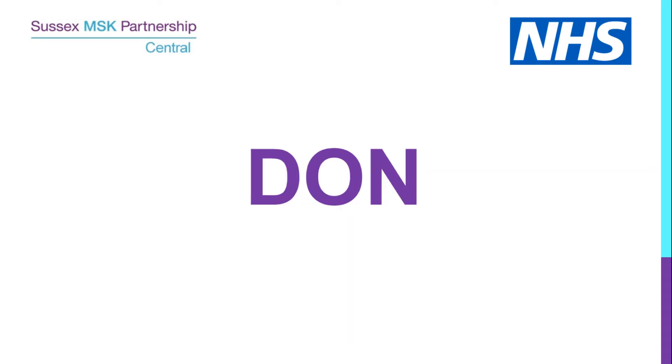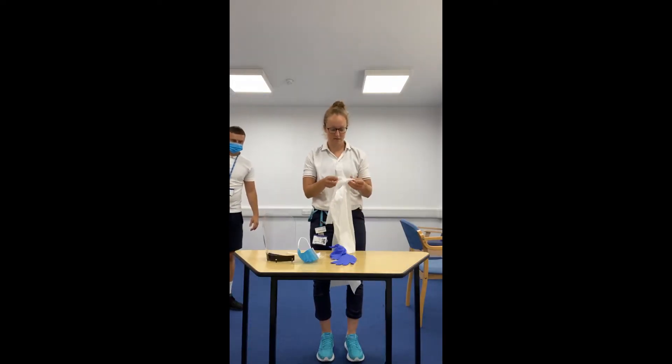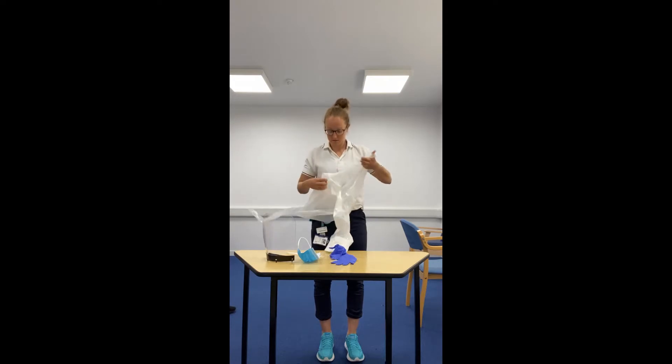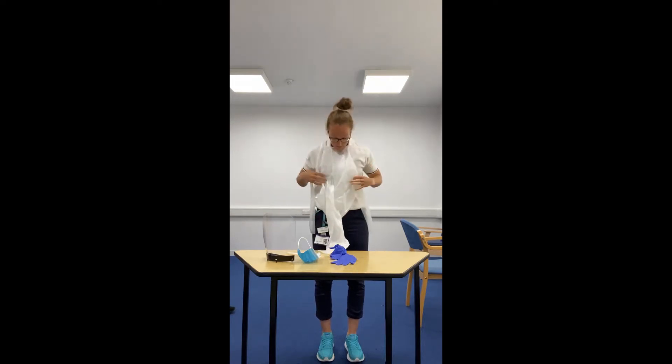When putting on PPE, start by washing your hands all the way up to your elbows. Remember you need to have clear wrists and be bare below the elbows.